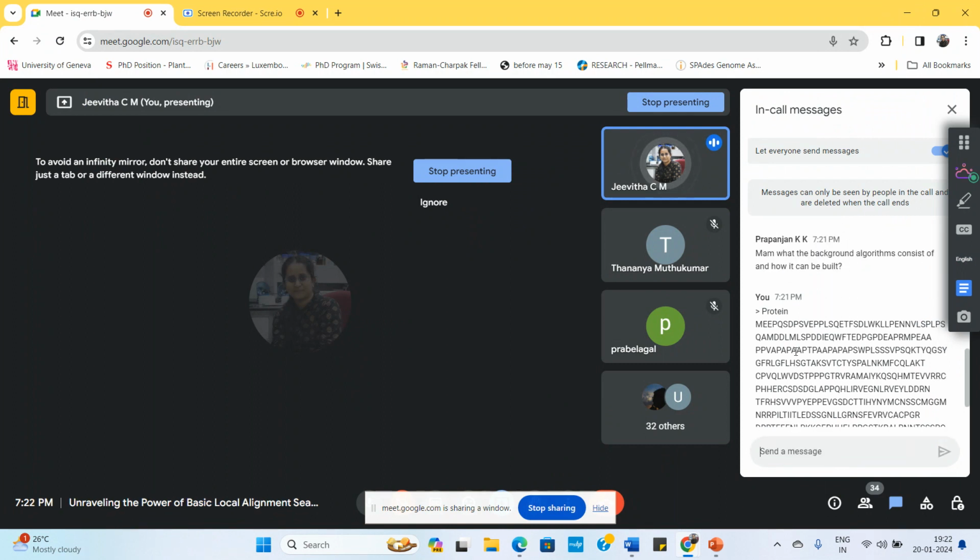Sorry, I'm unable to share the nucleotide sequence because it is very lengthy. I'll show you how to take the sequences from NCBI and how to do the BLAST. I'll answer your questions at the end of the session, because when we are doing the output you'll get so many confusions.